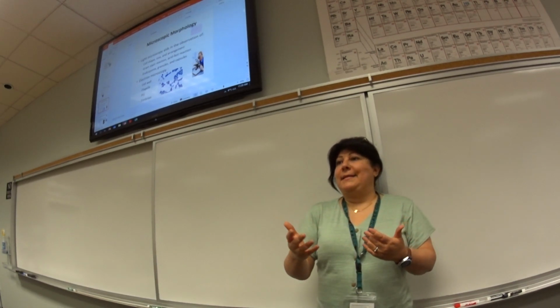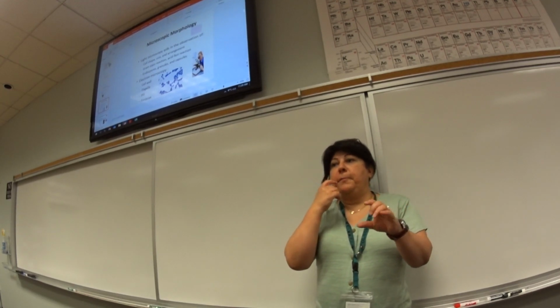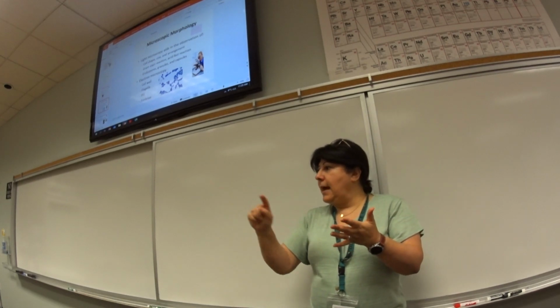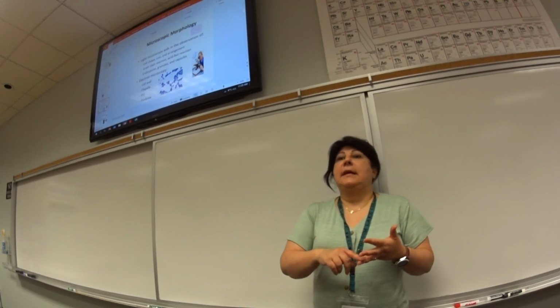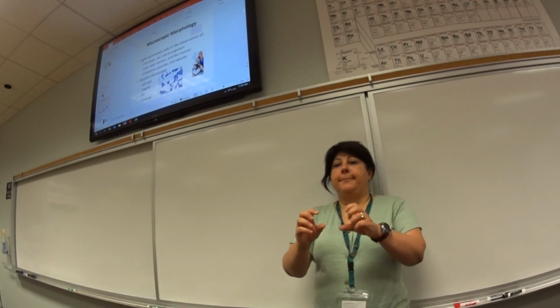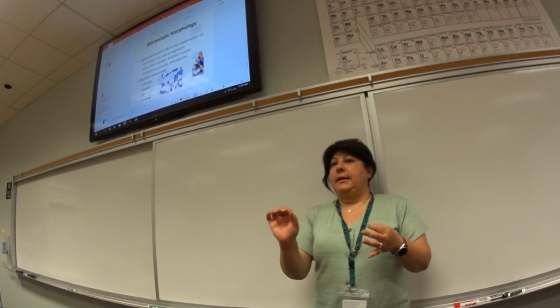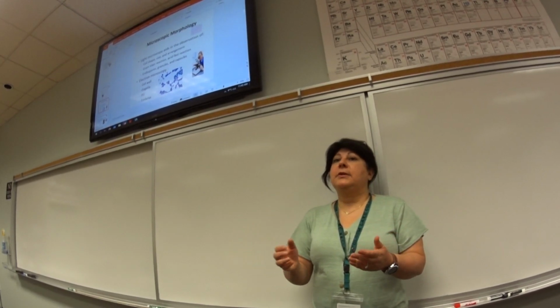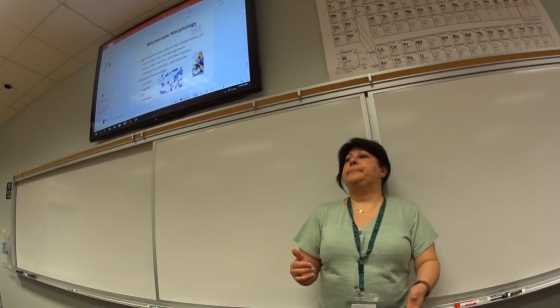You come back Monday, your day 2. Your day 2, again, you don't have to write purpose, you start with methods and materials. So you're doing mannitol, tell me how you set up mannitol agar. You're doing gelatinase, tell me how you set up gelatinase. What agar you're using, what is happening, so on and so forth. Your conclusion on that day is not much. I inoculated, I have to incubate everything for 24 to whatever hours. I will look at my results on the following day.